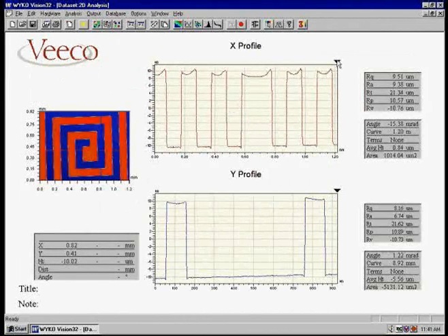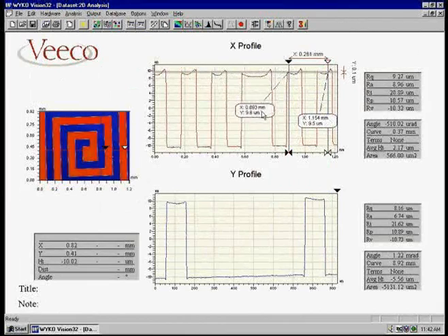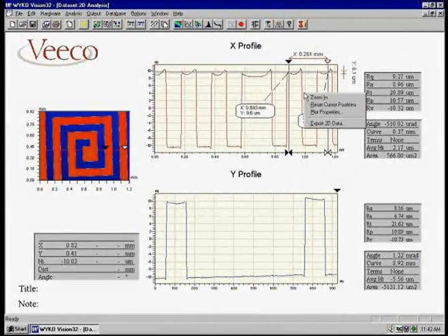You can measure the step height by clicking on the triangle and moving the cursor to the feature of interest. You can move the coordinate windows. The vertical distance will be displayed on the right and the horizontal distance on the top. You can also zoom in. Position the cursors on either side of the area you want to zoom in on. Right-click between the cursors and click on Zoom In.